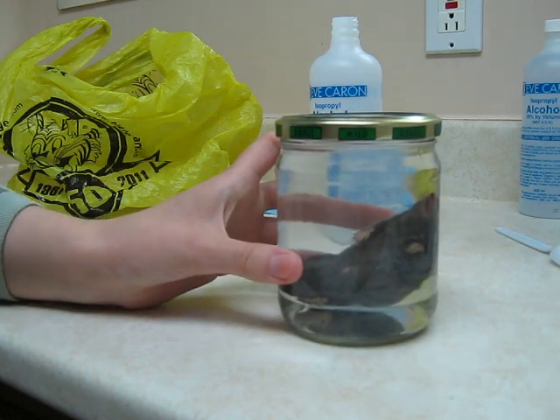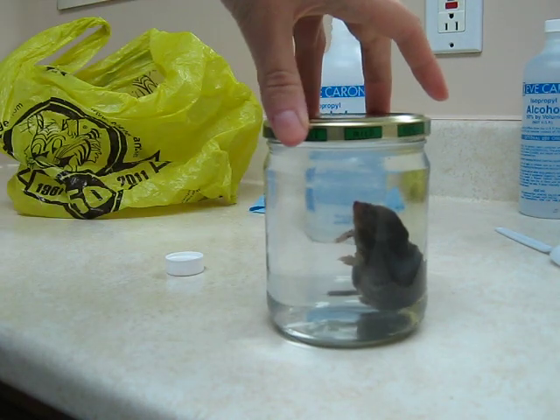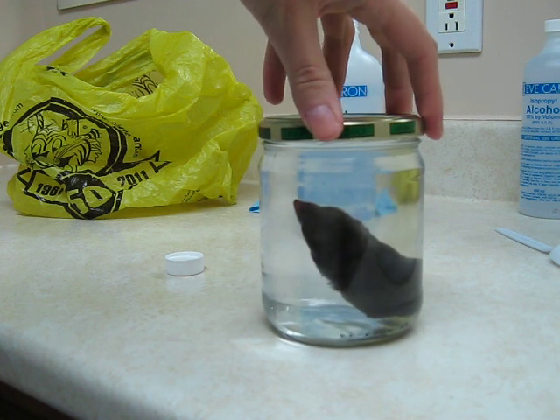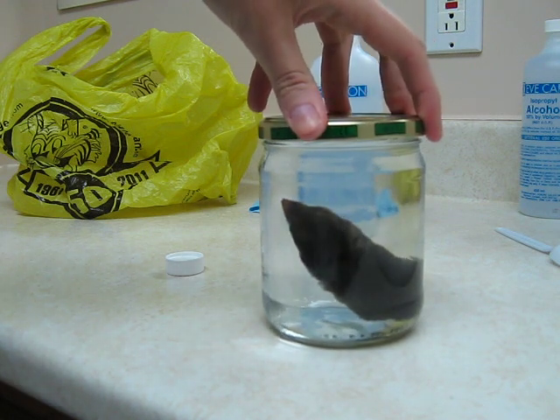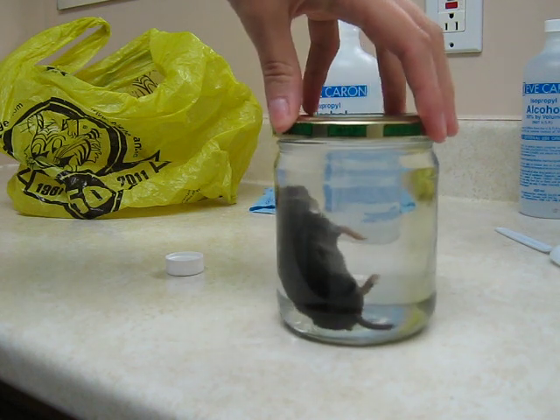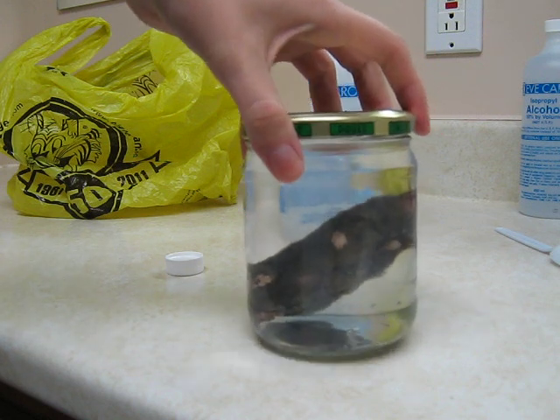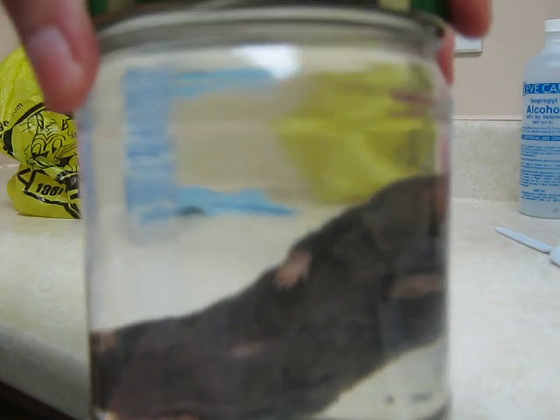You just close the jar like that — and voila! You've got your own little preserved animal right there. You can keep him forever, as far as I know. From my sources, this type of alcohol will preserve them pretty much forever.